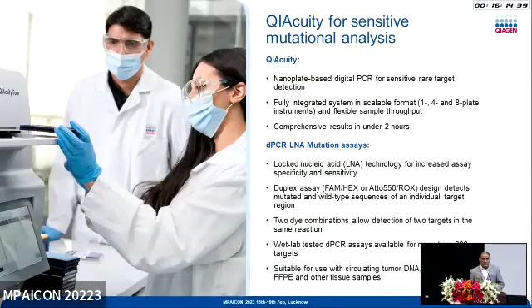And the next thing is digital PCR. It's an advancement in digital PCR chemistry. Earlier we had droplet based, now it's nanoplate based. The good thing about nanoplate based PCR is that it has already fixed partitions. The earlier challenge was that you needed expertise to make a good number of droplets. But here everything is partitions.